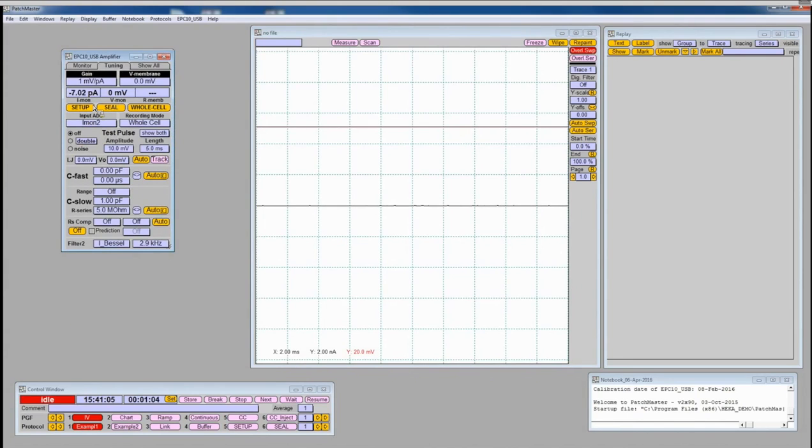And here you can now change, for example, the background color of those buttons if you want to. What I show you right now is completely optional. You can change it or not. It's up to you. I just want to show you how to do this. So let's say you would like to change the background color of this box here.